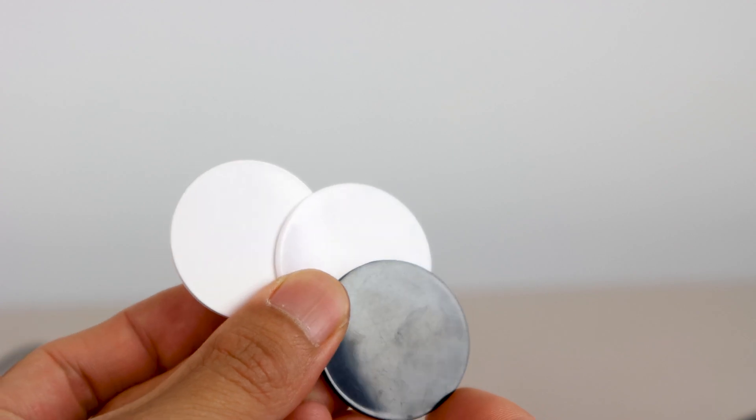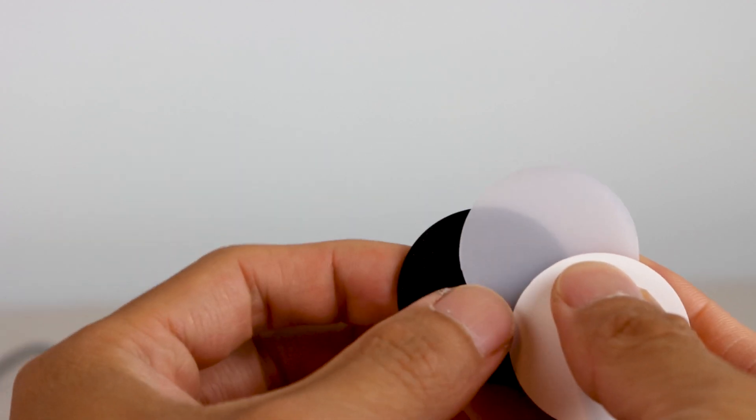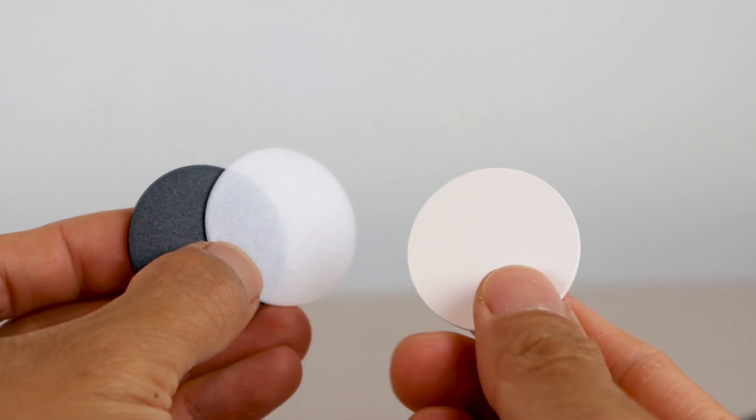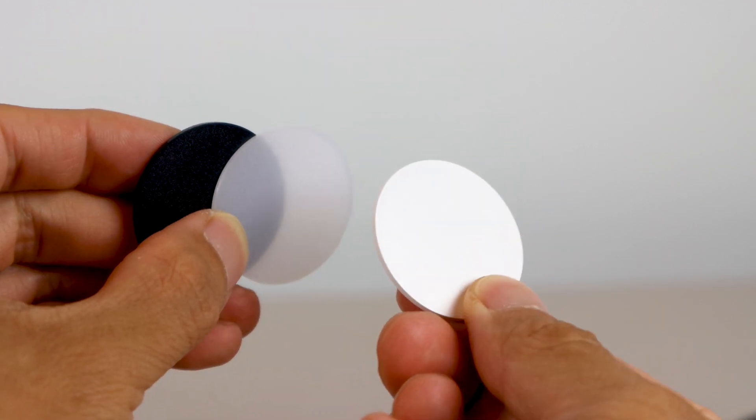When installing the filters, note that there's a shiny side and a matte side of each disk. Be sure to install the disk's matte side up so that the light can pass through and diffuse correctly.